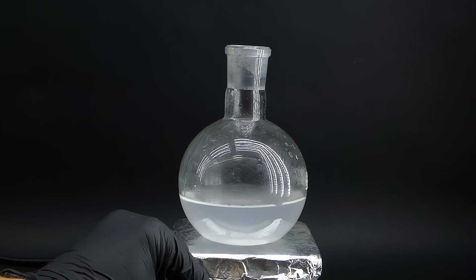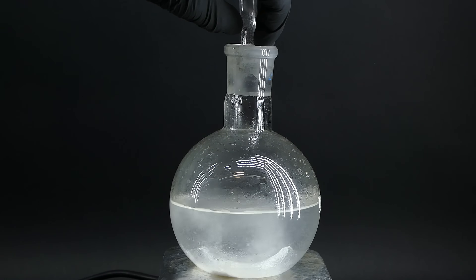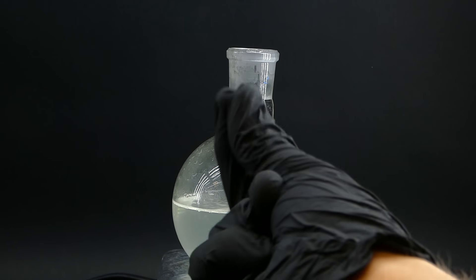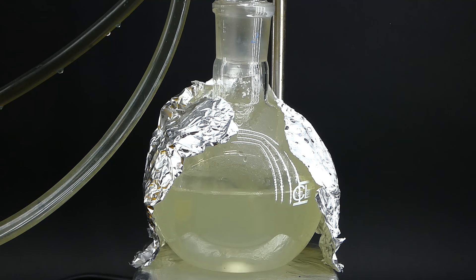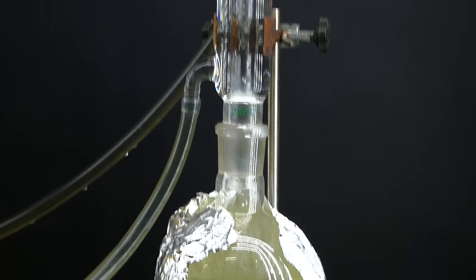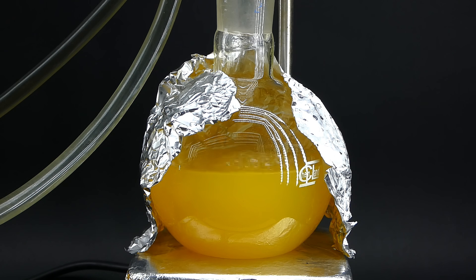To make the benzaldehyde, I got my cinnamaldehyde water flask onto a hot plate with stirring, then added some more distilled water and got all of my freshly made sodium carbonate into the flask — about 3 grams, which is the amount I felt would be good for this reaction. After the addition I set up a reflux, whose job is to condense any vapors that rise from the mixture below, which I will have to boil for around 10 hours. In this reaction, the cinnamaldehyde under the presence of sodium carbonate and heat breaks down into benzaldehyde and acetaldehyde. Acetaldehyde has a low boiling point and escapes the mixture, pushing the equilibrium to the benzaldehyde side. Acetaldehyde is also really toxic, so I did this whole thing under a fume hood, and when everything was running smoothly I left the setup to run overnight.